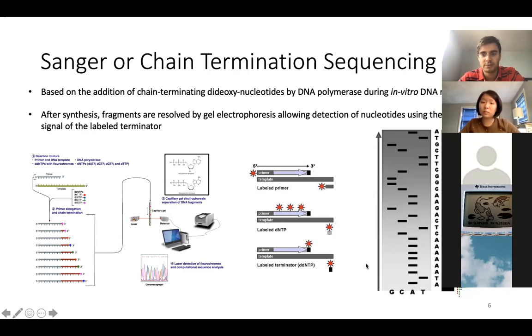So, when I was learning about this, I used to hear people saying that in the beginning, they did Sanger sequencing by using huge gel electrophoresis. My impression is that this changed over time. Later, they used capillary gel electrophoresis, but this sounds to me like something that was a development of big gel electrophoresis. So I'm just trying to say that of course, there was development in the technology, and I'm also trying to tell you that I'm not as old as someone that has worked with these big gel electrophoresis in the beginning, I believe, of Sanger sequencing development.